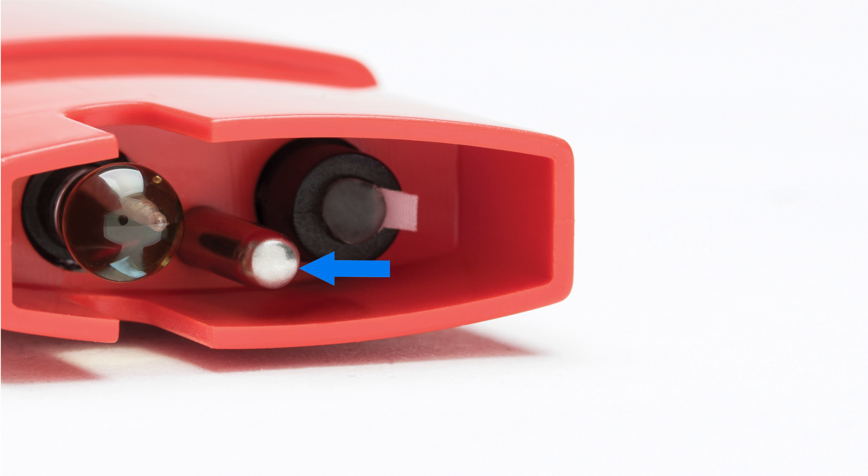The exposed temperature probe of the Fepps provides for a rapid temperature measurement in order to compensate for any temperature variations in the calibration buffers or samples being measured. This is absolutely necessary to achieve a high-accuracy reading, especially with samples at the extremes of temperature and pH.